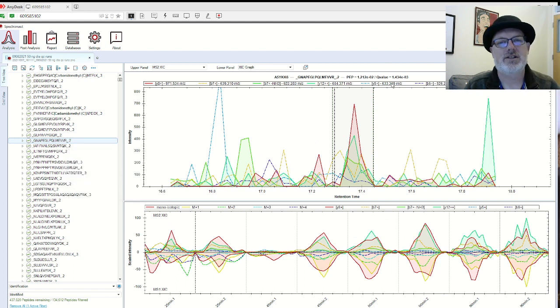And we can tighten up these Q values if you want. But some of them, these look good. Look at how nice this data looks for this one. And you can see how they vary across. You can see there's something wrong with this 45-minute run.